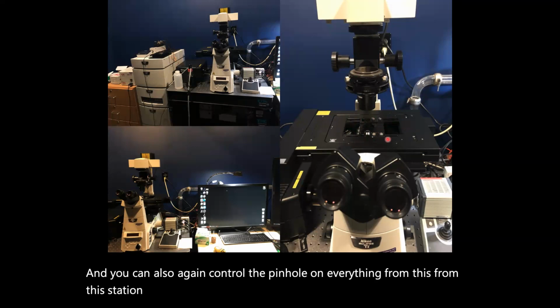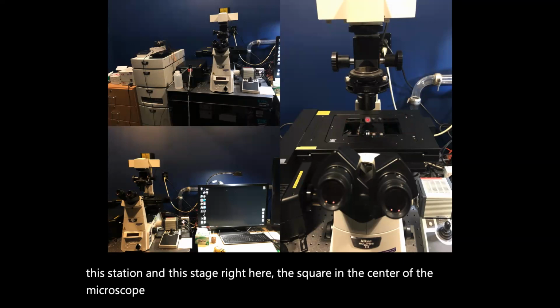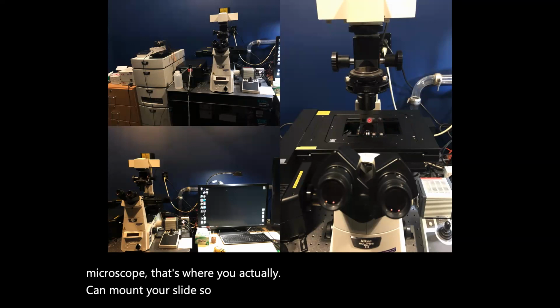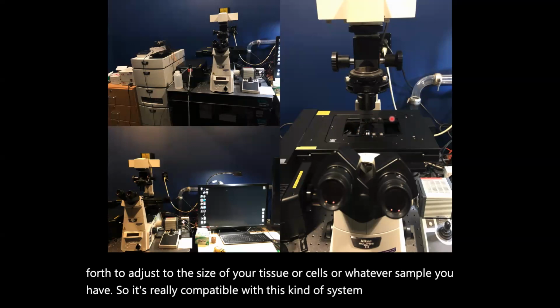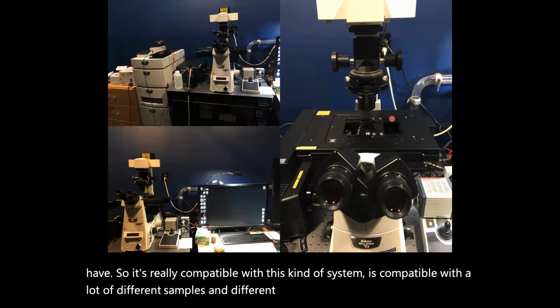And this stage right here, the square in the center of the microscope, that's where you actually can mount your slide. So there's this little section here in the center that you can slide back and forth to adjust to the size of your tissue or cells or whatever sample you have. So it's really compatible. This kind of system is compatible with a lot of different samples and different sample sizes.